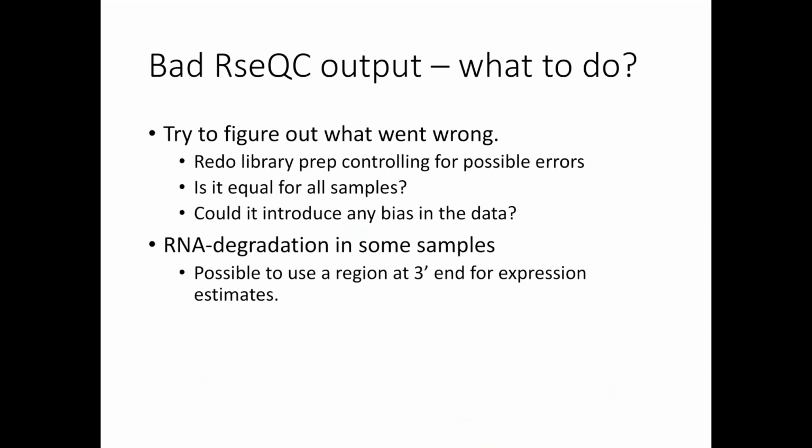Even though you see a lot of things that don't make sense or things that weren't what you expected, it doesn't mean that you should throw away your samples at this point. But you should really mark them up and keep that in mind when you start doing analysis downstream. If you see changes that might be due to this, then you should keep that in mind.